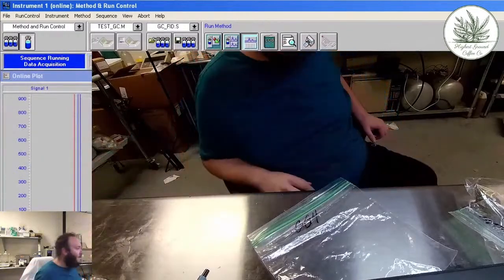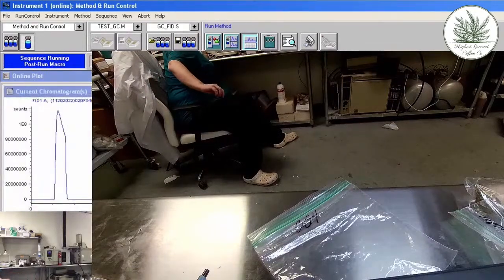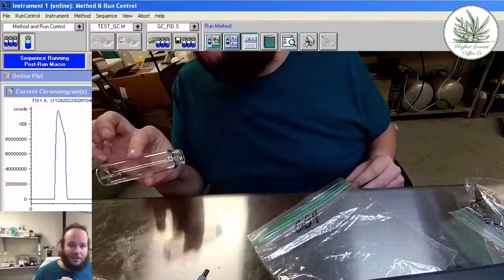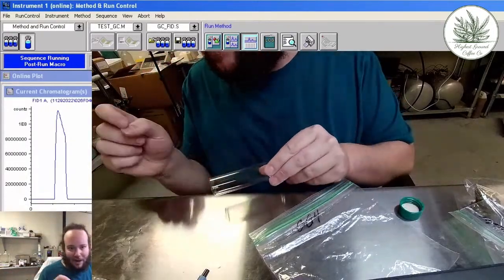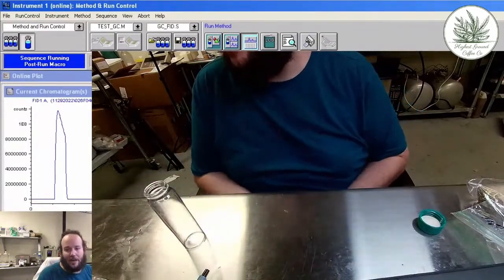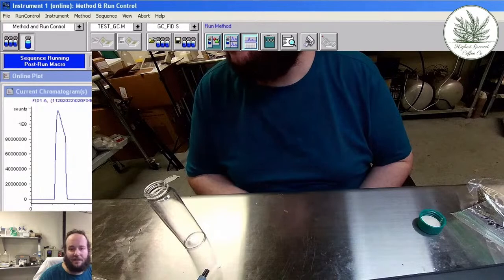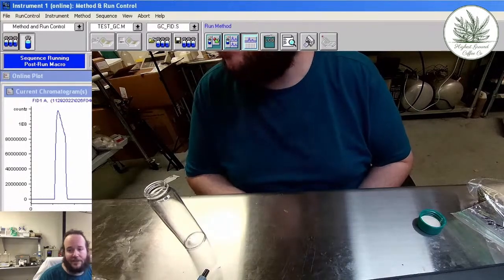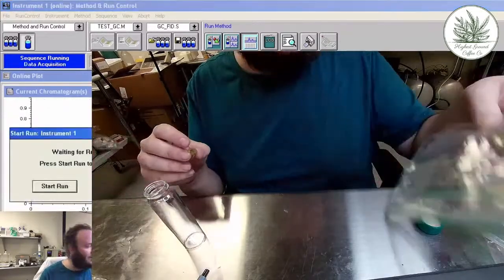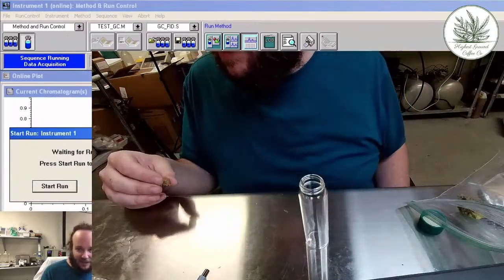Okay. So all you got to do, you'll get a vial similar to this. It'll be labeled. You can write on the label. But all you do, get your bud that you want to sample. And what I say is you want to test it in the form that you're going to consume it, right? So if it's not fully dry, don't send it in unless it's fully ready to go. So as you would consume it, that's the form to send it in for testing.